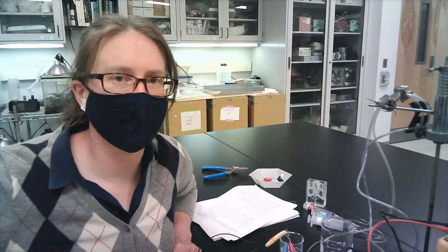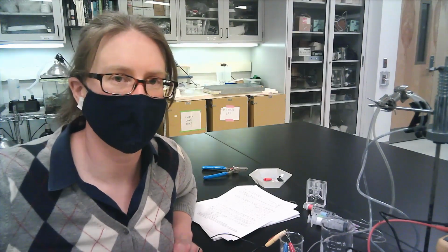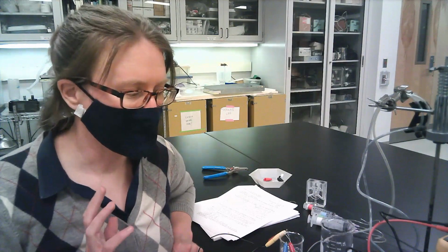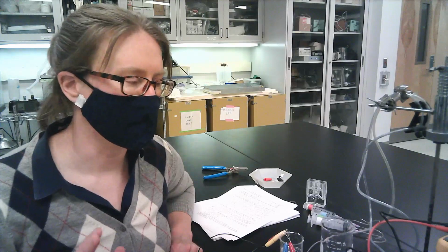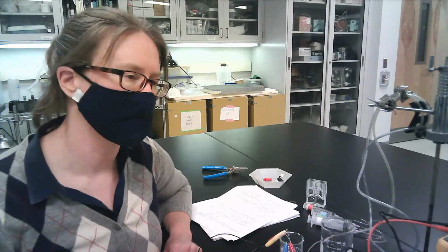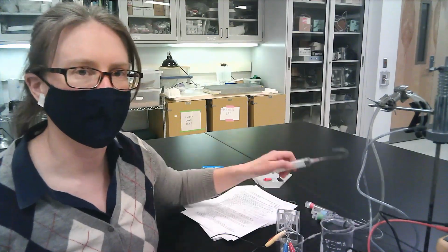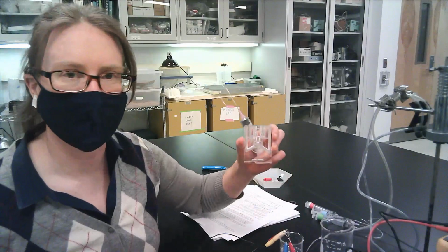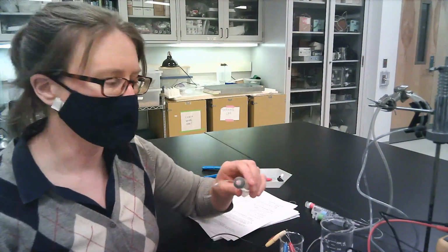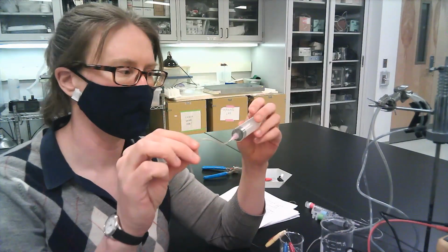So once you've got your wiring all configured and you've got the lab chart set up and running, and you're starting to record voltages and currents, once you've set your short circuit current, then it's time to start doing some experiments. For the experiments, what that's going to involve is removing and adding different solutions into the Ussing chamber. For that purpose, you'll have a set of syringes on your table that have some flexible tubing on the end of them.